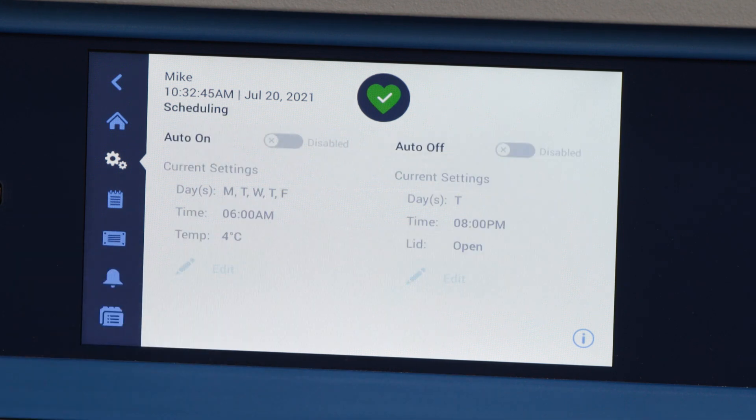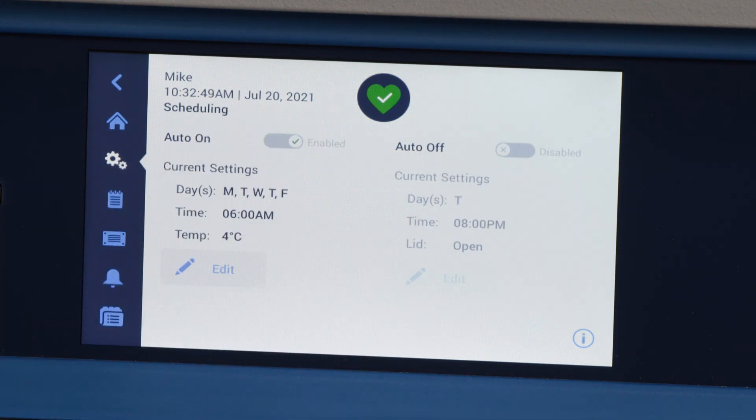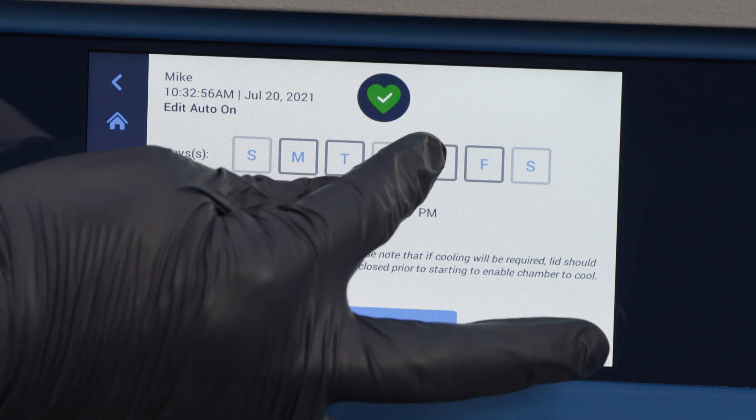One of the most unique features about the X4 is the scheduling function, which will allow you to set the unit to turn on and turn off at specified times. You can program the auto on and the auto off independently at your convenience.